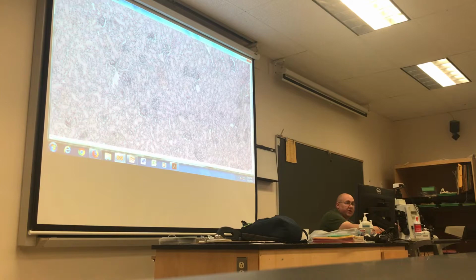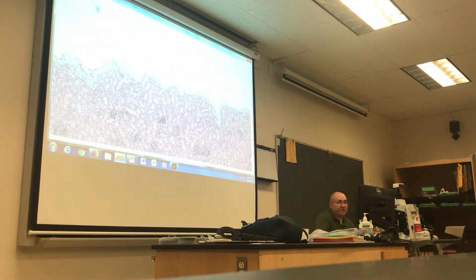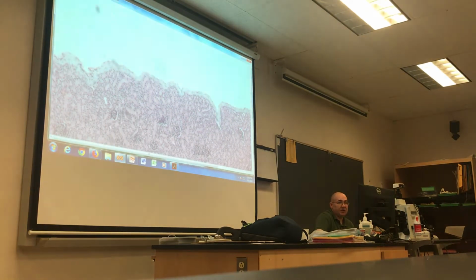You do have a renal capsule that you can see pretty well too. If we move a little further out here, see this little fibrous capsule on the outside here? That's the renal capsule, right? Not to be confused with the renal corpuscles down there, right? That you're kind of saying. So that's all towards the outside of the kidney, right?